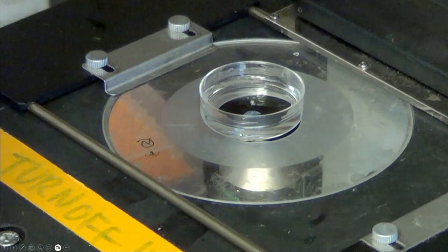So you wouldn't use these for experiments just after slicing. You'd want to give them some time to recover and rebuild damaged tissue. I like to go even 4 or 5 days. Give them 3 to 5 days to recover and be a healthy lung slice.